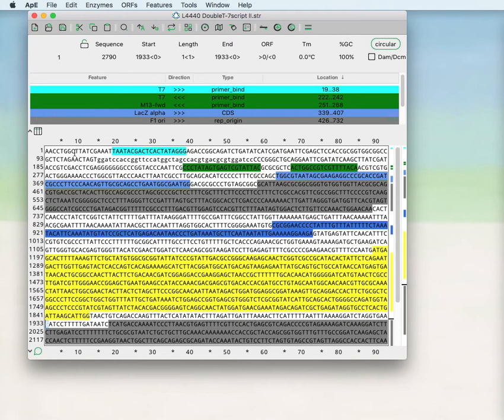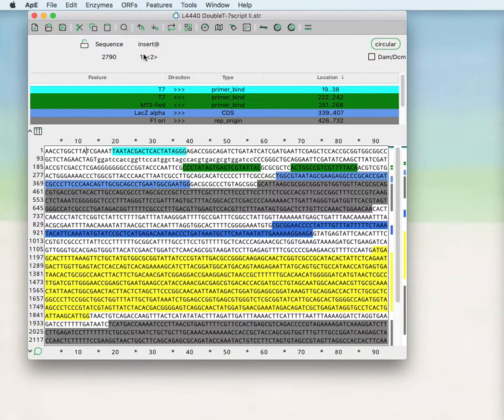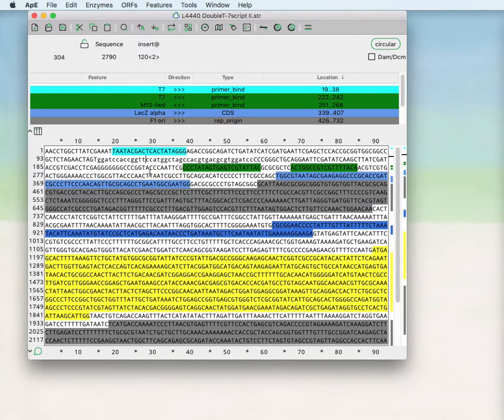The currently selected region has information displayed up here. If you have no selection, it will show the length of the sequence here and the insertion cursor position here. You can double-click here to change that and move your insertion cursor to a different position.